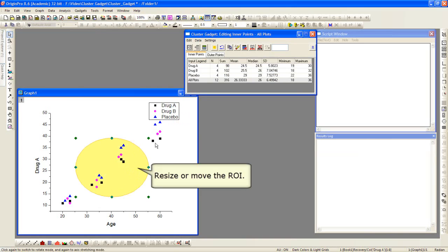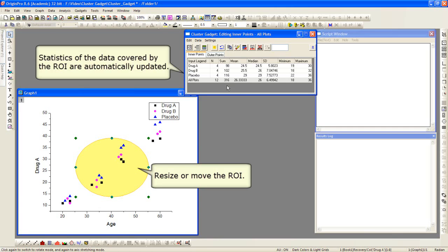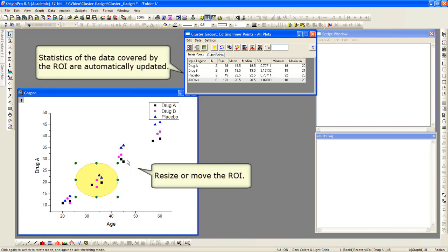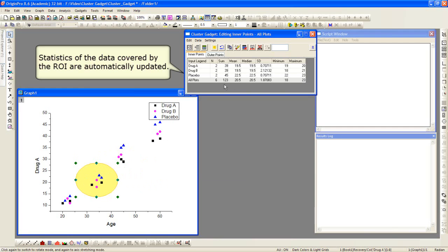Now as I move this, you can watch in the dialog above, the statistics will be output. The data that's covered by the ROI box is the data points that the statistics are performed on.